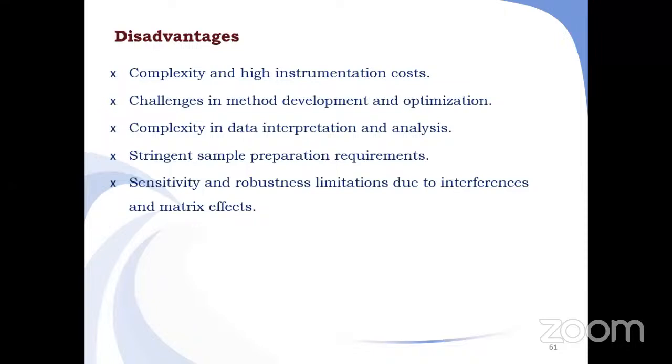Among these, LCMS is the preferred hyphenated technique. In the current scenario, we move on with LCMS and GCMS.